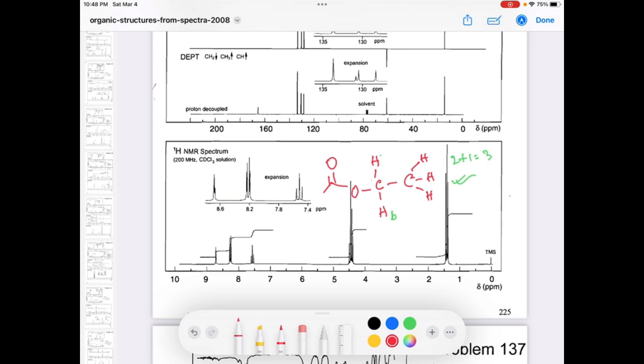Now in the aromatic region, we see that we have an aromatic ring, so the aromatic ring should be connected with this carbon directly. Since we are saying we might have 2 of this group, they should sit on the aromatic ring in such a way that the molecule is symmetric, and also so that you can get a triplet, doublet and singlet.